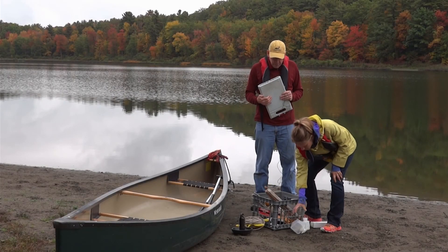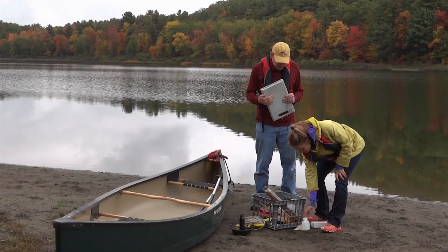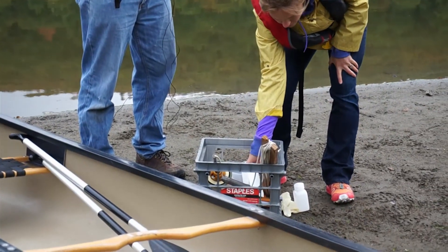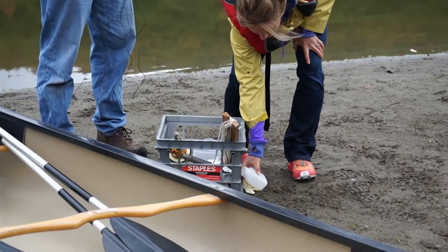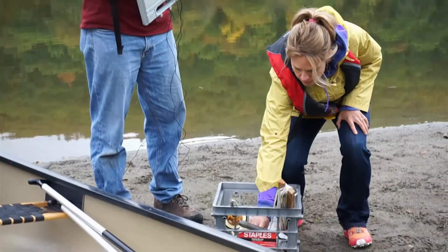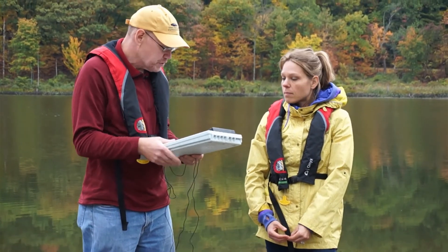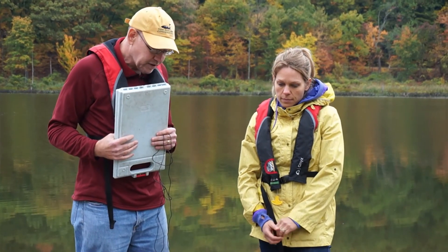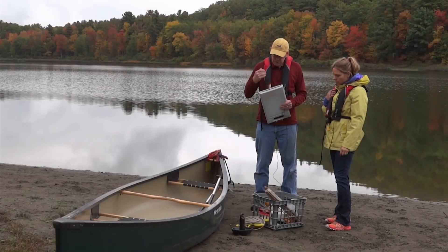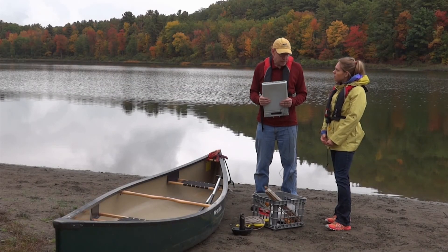The water sample that's collected is going to be put into a collapsible container, which you can then put in the crate. We're going to take a thermometer, which we have in a little box here, and also place that in the crate. And then, just in case we encounter a harmful algal bloom, we want an algae bloom bottle and some gloves to protect yourself. We also want to make sure that we have some paperwork with a clipboard, and we want to make sure that we have PFDs on, so that we are first and foremost being safe.